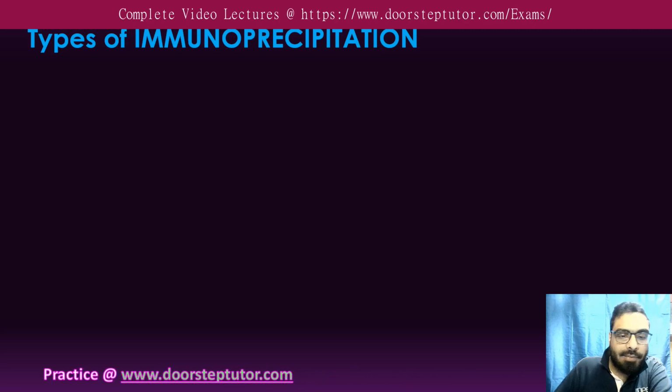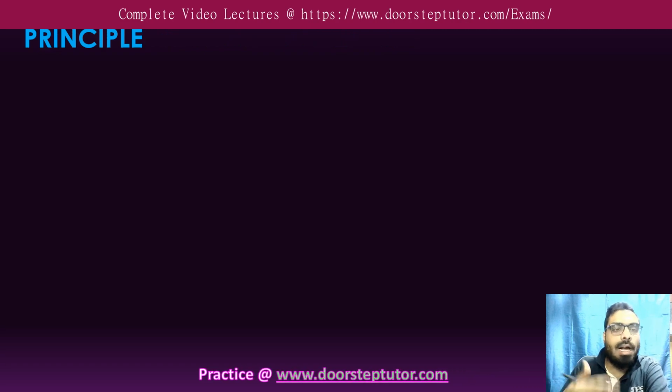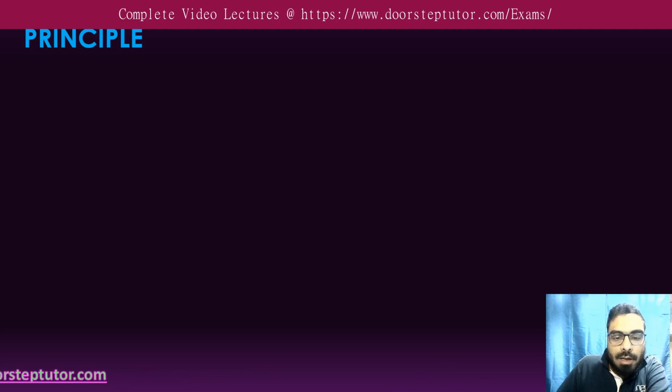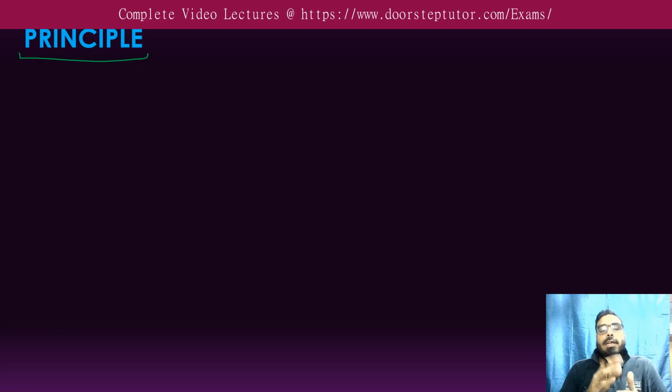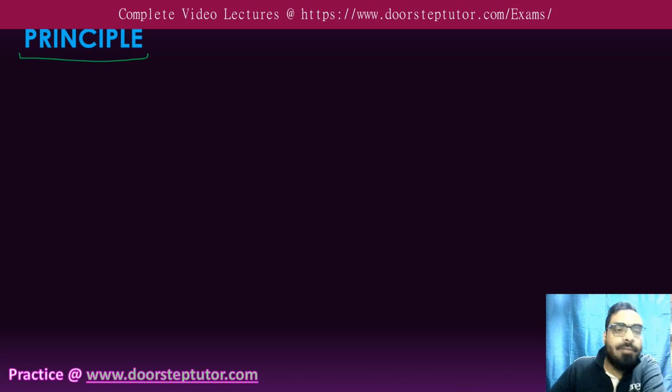For example, as I have already told you on the first slide, that first is your... okay, I'll just discuss the types a little later. First, let's see the principle. So for the principle, as I told you in the immunoprecipitation slide, some antibody is used, and it is used to take down a specific protein. So how will we do it?